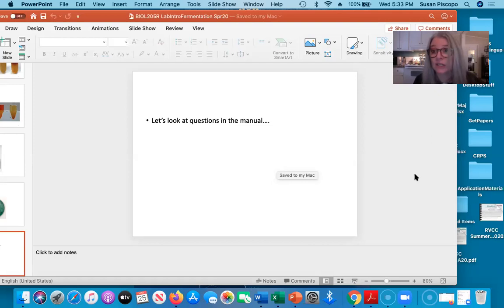Okay, good question. And down at the citrate test table, it also asks about the control. What color should our control tube be when we pull it out of the incubator? The answer is, it should still be green. We should still see a green color in that tube. For citrate, if we get a positive result, that slant tube is going to turn blue. All right, now take a look at page 123.